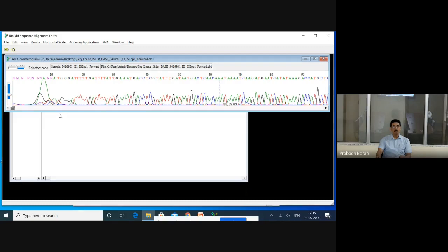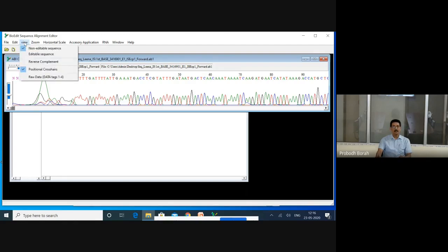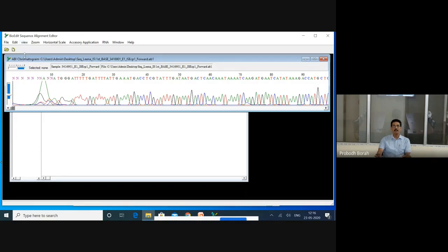To proceed for editing using BioEdit, first go to the View menu. You will see that a raw sequence will be in a non-editable format by default. To start editing, you have to make it an editable sequence - click on 'Editable Sequence' in the View menu. This is a common mistake: without changing from non-editable to editable, you cannot proceed with trimming and editing. Please remember this step.